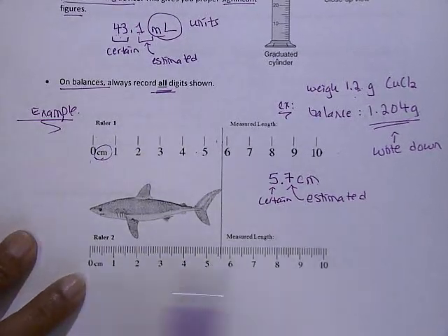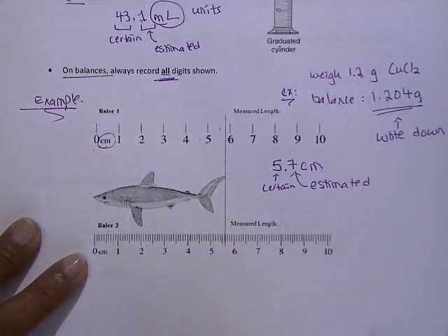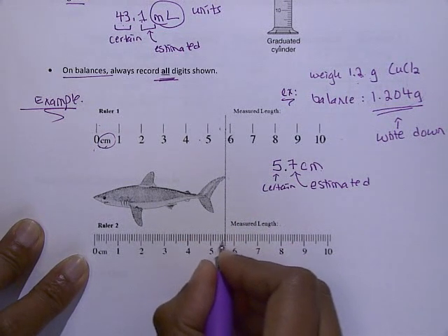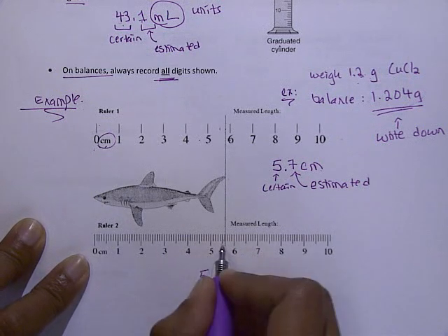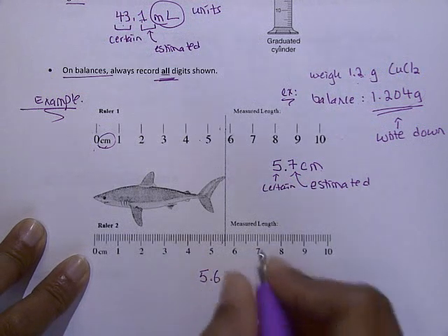Now let's take a look at this ruler. Notice how the increments are actually a little bit more precise, more graduated. So again, the shark tail is beyond 5, so I'm sure of 5. There are actually increments here, which also gives me some certainty. So here I have 5.1, 5.2, 5.3, 5.4, 5.5, 5.6. This dotted line is right on 5.6.